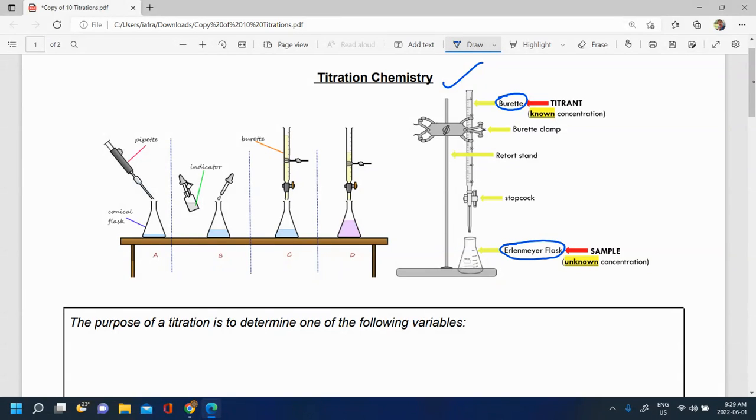The idea is that within the Erlenmeyer flask we put a substance with unknown concentration. So we don't know its concentration. For example it might be an acid, it might be some HCl with an unknown molarity. It doesn't have to be HCl, it could be some other acid or some other substance.